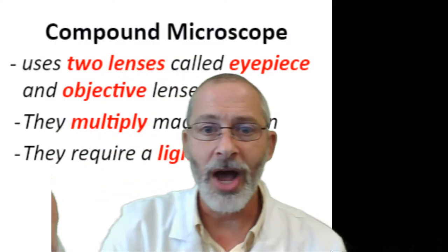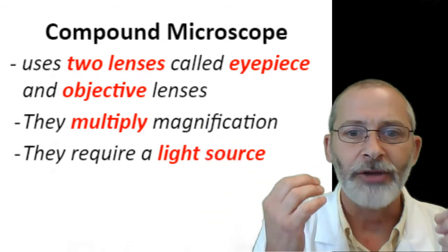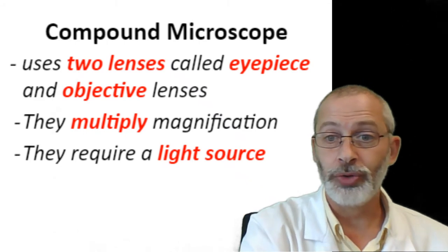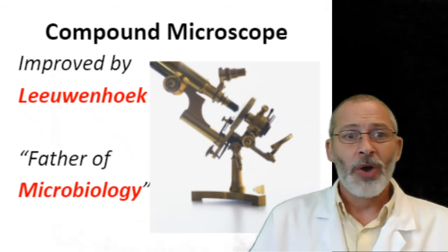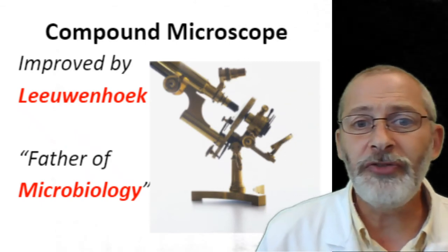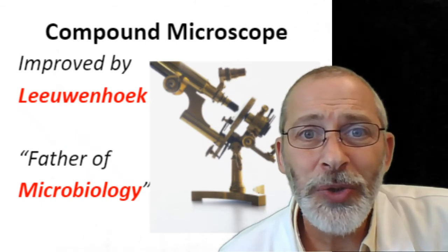All right, so compound microscopes, because they zoom in so much, require a light source in order to brighten up what you're looking at. All right, back to the compound microscope for a moment. Oh boy, compound microscopes were improved upon. Does this name look familiar to you?